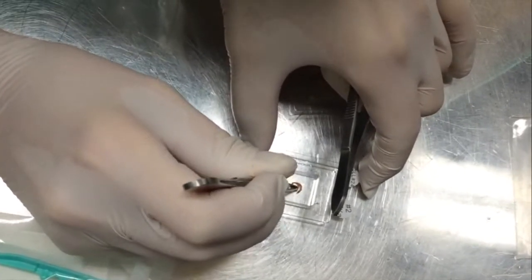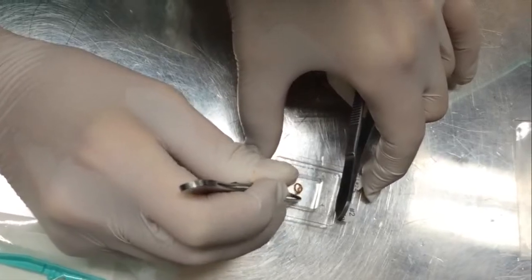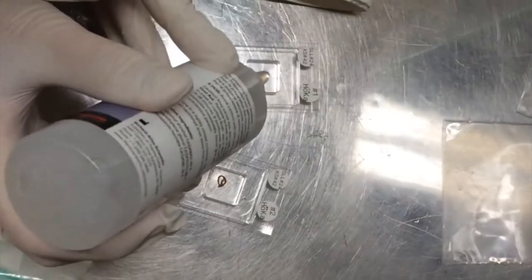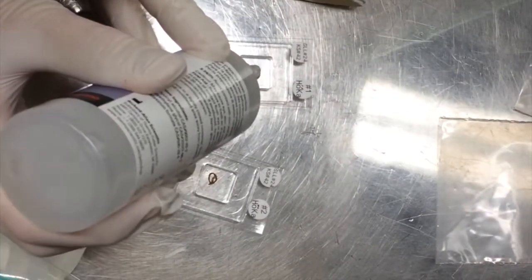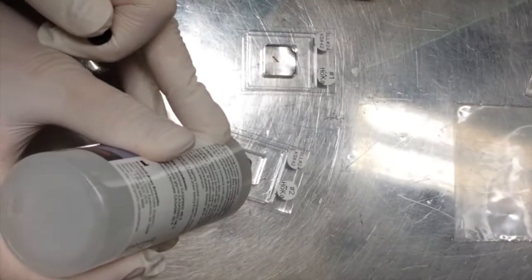Remember to always work with sterile tweezers and to work fast in order to avoid RNA degradation. When the needle biopsies are properly placed, cover them with OCT. Be careful not to introduce any air bubbles.